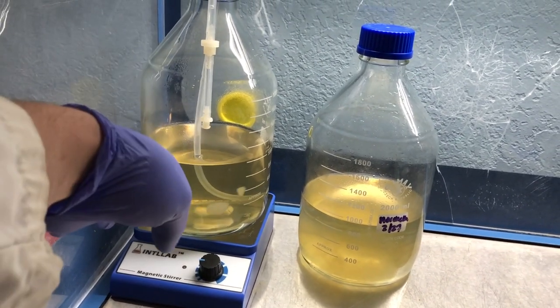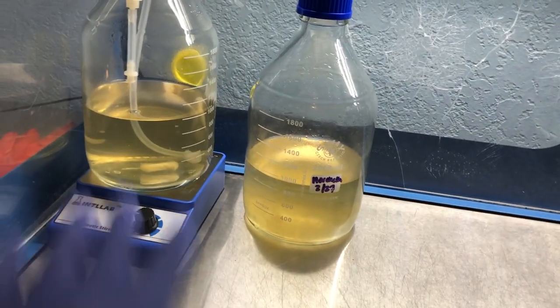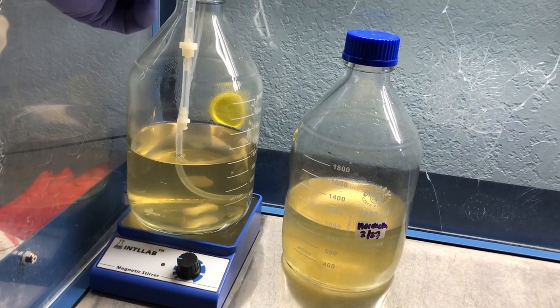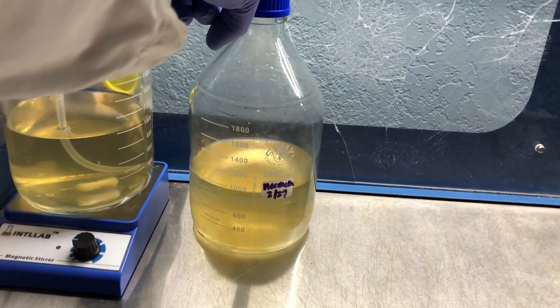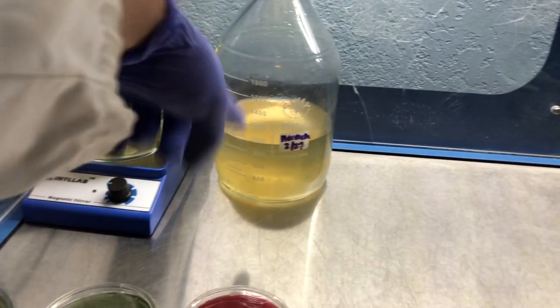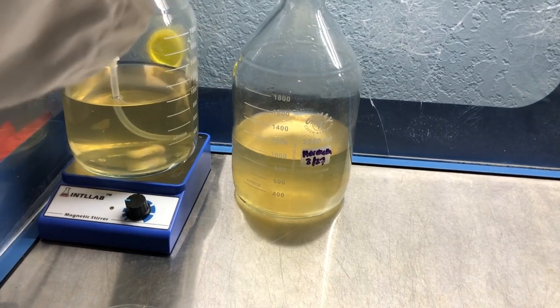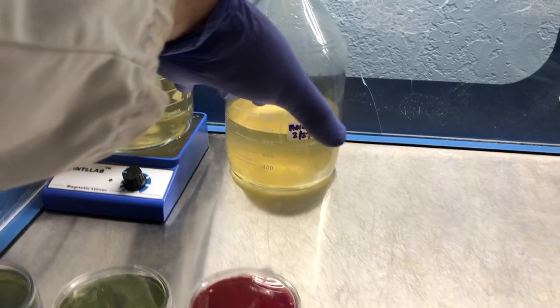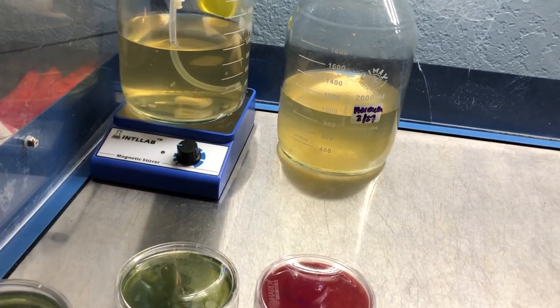So I always QC my liquid culture first, and then once we QC these, I'm going to re-sterilize this media extractor, and then I'll be putting it on the morel liquid culture and running this on sawdust, grain spawn, and I'm just going to put some diluted amounts of liquid culture in buckets and inoculate that directly outside.